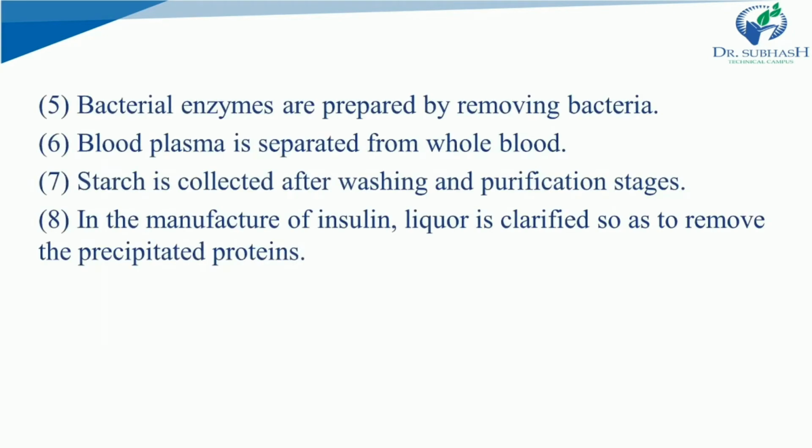Now, before we move further, do you know what clarified means? We have studied in filtration that clarification is a type of filtration, right? Which means in the manufacture of insulin, the liquor is filtered or separated. You can easily call it a type of separation so as to remove some of the precipitated protein that is not required, or some that is most required.